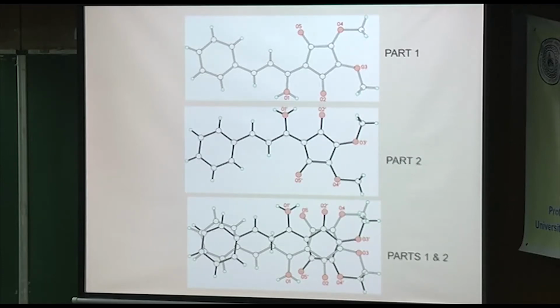But when you first look at that, of course, in a difference map, you go, wow, what is that? So we were able to successfully model that and get a very low R value compared to the publication. But anyway, it was just an exercise. Now, whole molecule disorder is much rarer than other kinds of disorder, like with solvents and that kind of thing. But it does occur. In fact, the C60 example I showed you was whole molecule disorder. I took a whole ball of C60 from another structure and pasted it in as a rigid group to model the two on top of each other.